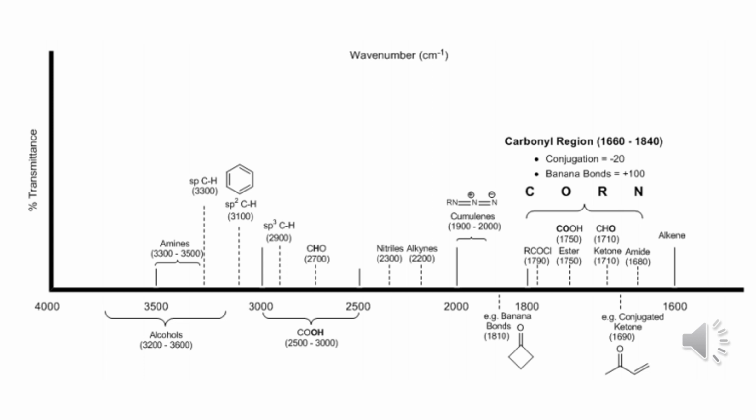We know that infrared spectroscopy identifies molecules based on their functional groups. Chemists using IR spectroscopy use a table or chart to identify these groups. Each functional group has a different wave number, listed in inverse centimeters, and a typical appearance. Mostly, what we can observe during the experiment is the stretch of an OH group, such as water or alcohol, which occupies a very wide peak with a wave number near 3500.